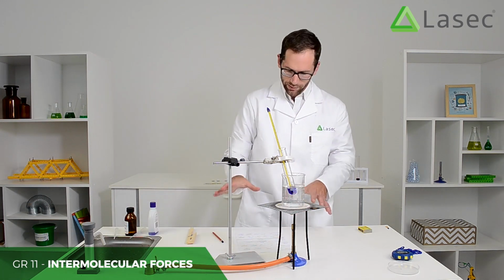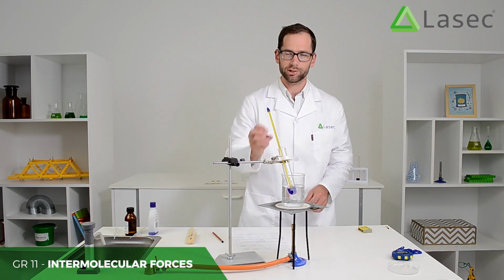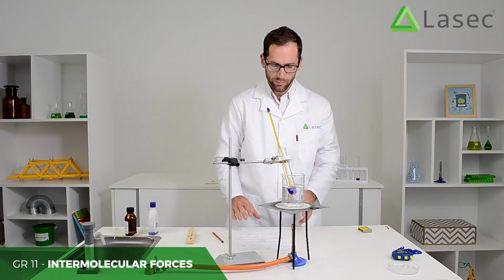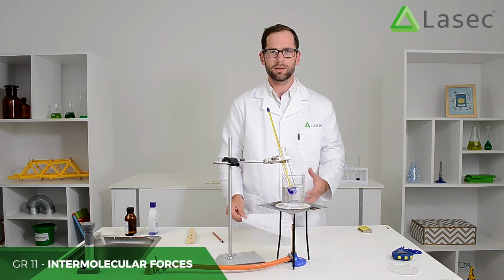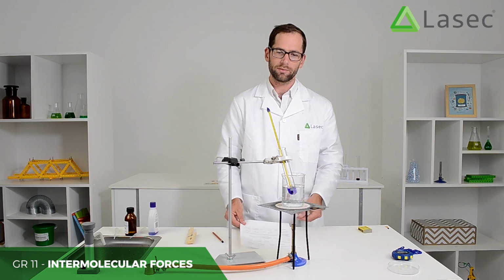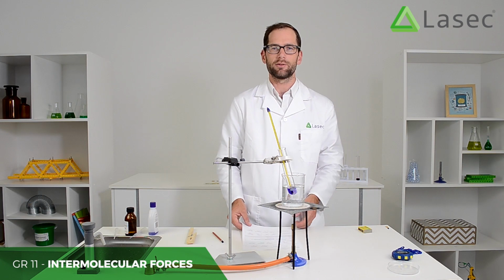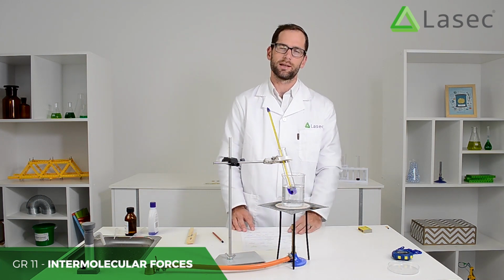So now that I've checked those, I can write them down. My water boils at about 100 degrees Celsius. I'll check that as well. The learners have to check and record every single time. And then afterwards, when they've got all their results on a page, they can present that to you in bar graphs, tables, and summaries. I hope they've enjoyed learning about the intermolecular forces, and remember, as you teach the theory, to apply it to each of these chemicals and experiments.